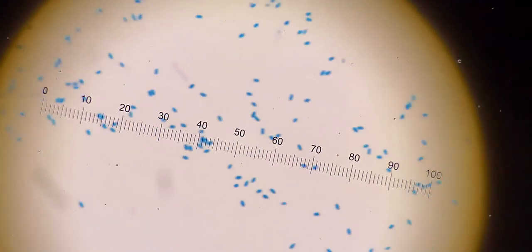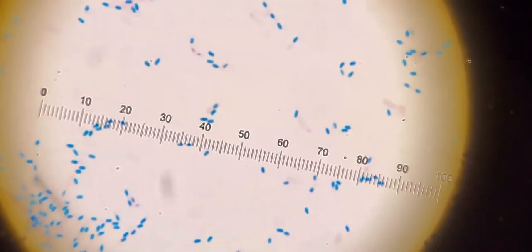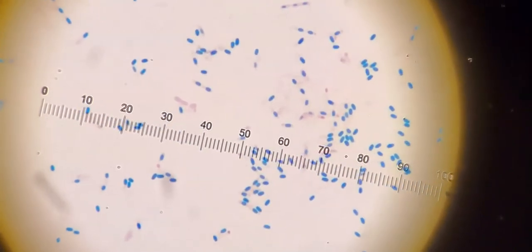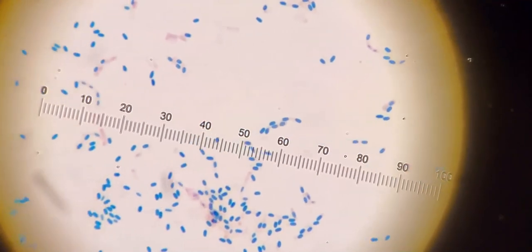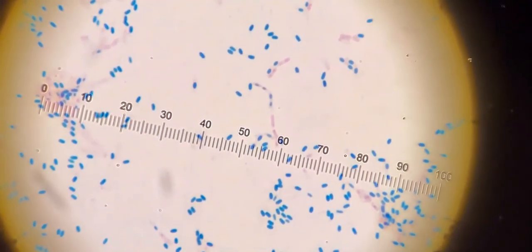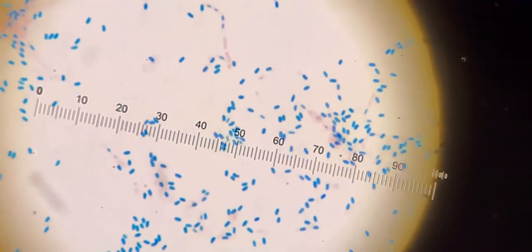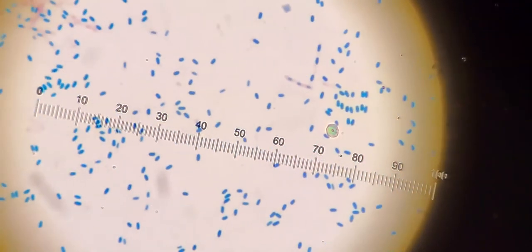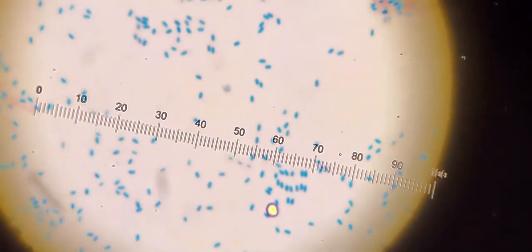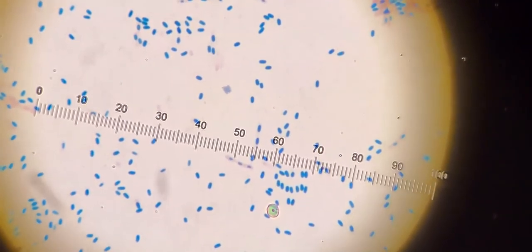I found a field with a few of them in here. What we want to do is try and gauge where these endospores are relative to the cell body. We can definitely tell the shape of them and it looks like we can see a few of them inside the body of the cell there. That's what we want to look for: to try and gauge the size of our cells and also the shape and the location of the endospores that are inside. The majority of what we see here though are exospores but right there we can see some of the cell bodies. There are some endospores in there but the majority of this specimen are exospores.